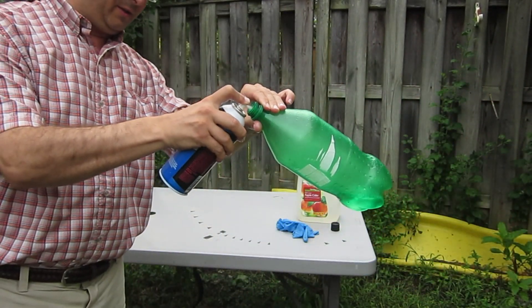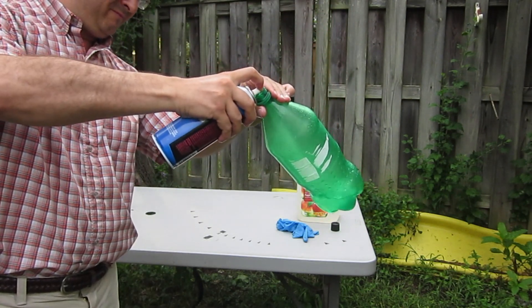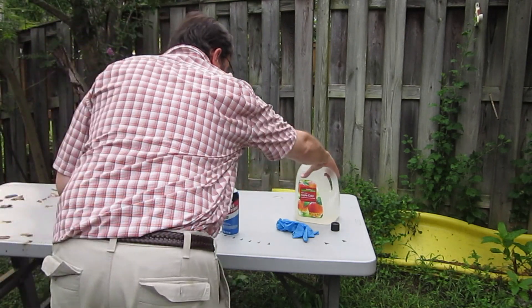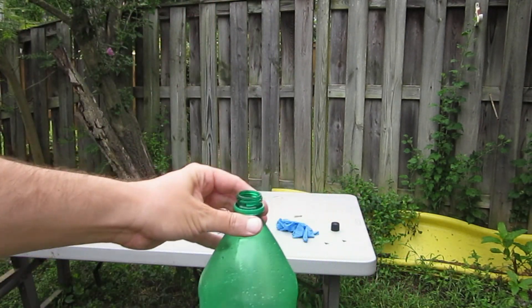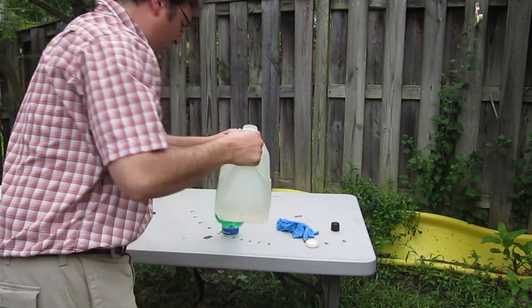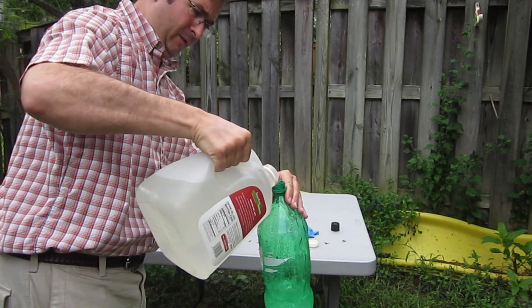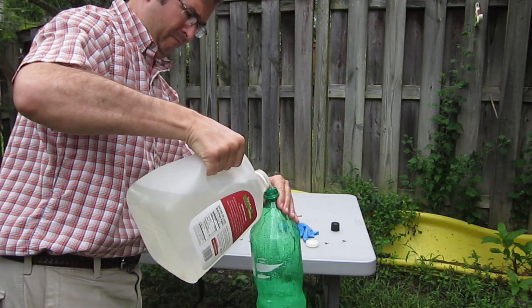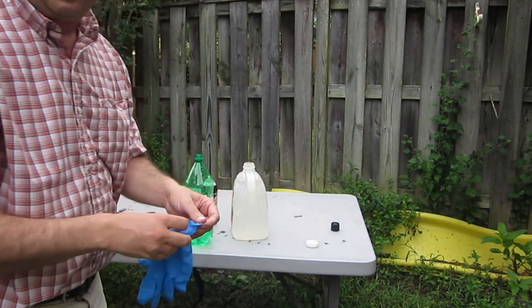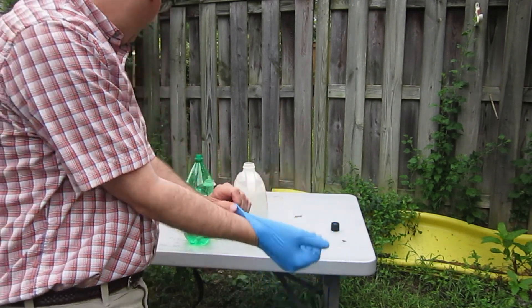Alright, we're going to make sure we get the ether inside there. Now we'll get some water and add it in with the ether. I'm going to stick my gloves on and try to minimize my exposure to this as much as possible — although I probably should have put them on before I started spraying, because it was just spraying all over the place.